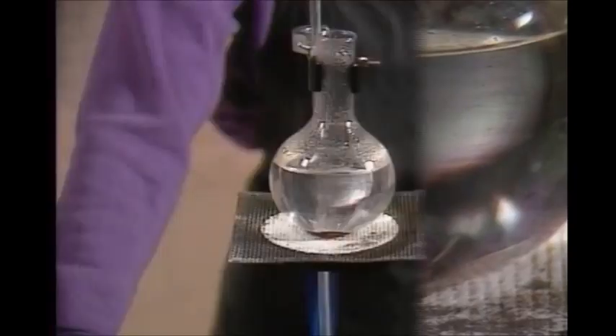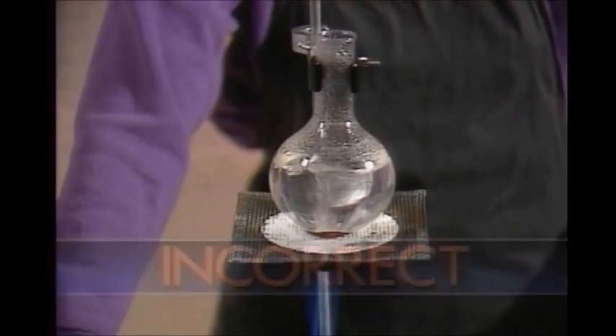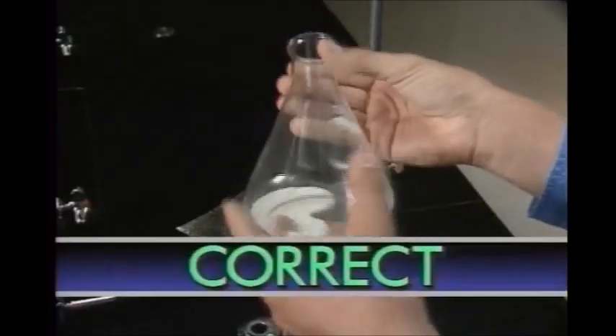Cracks or stars in glassware are dangerous. They can break open when heated. So before you heat any glassware, check it carefully for cracks or stars.